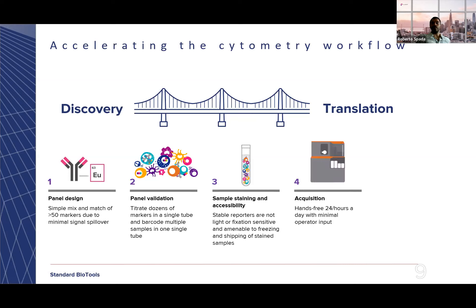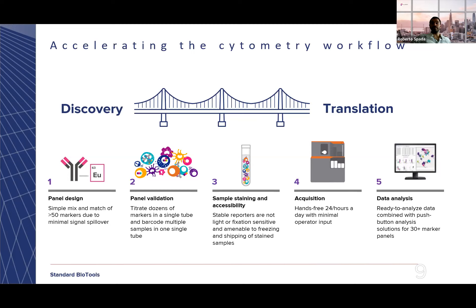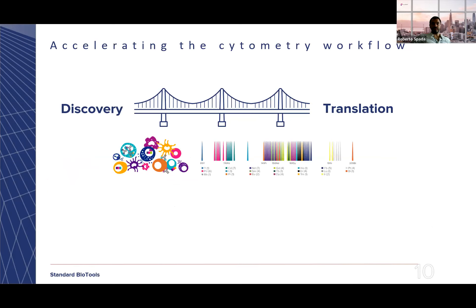With the CyTOF XT, the newest generation of CyTOF cytometers, you now have an instrument that allows hands-free 24-hours-a-day acquisition with minimal operator input. The data coming out of this fourth generation cytometer is ready to be analyzed, and we even have ready-to-use software which gives you analyzed data in less than five minutes after pushing the button once the data comes out.